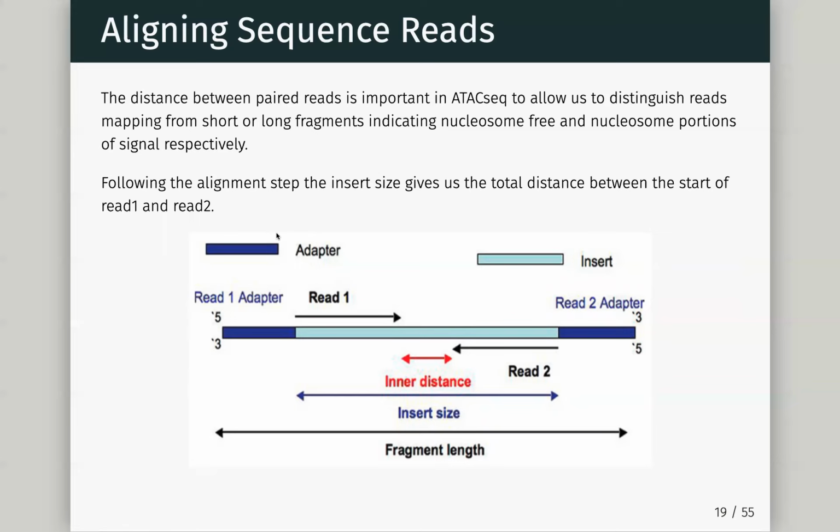There's a little bit of a confusion when you go to your genome center. You're going to have difference between fragment sizes. Remember, when you go to your genome center and you get that final size of your fragment, that often includes the Illumina adapters to the end of your fragments, and they are just required for sequencing. That's where we start sequencing from. But it's this insert, this fragment, which is our arbitrary sequence.